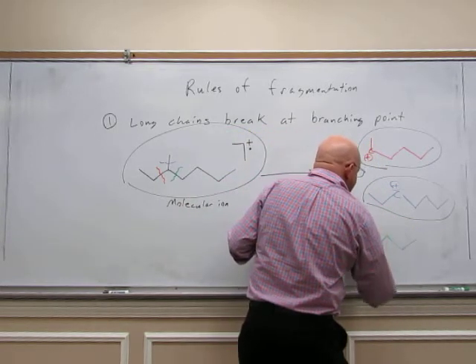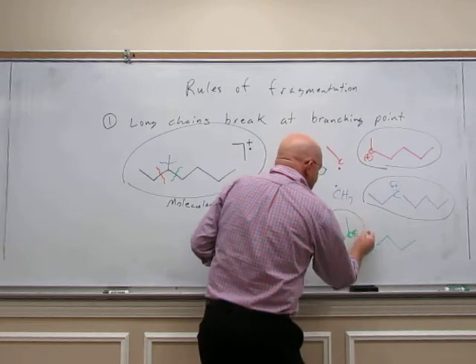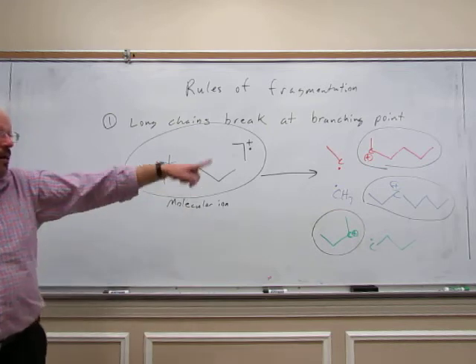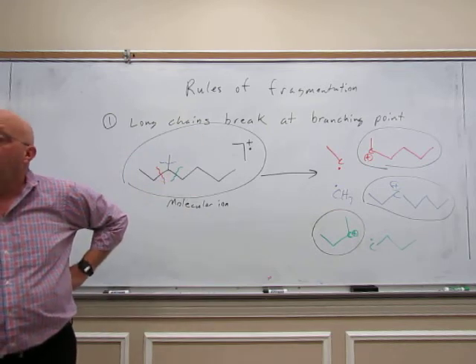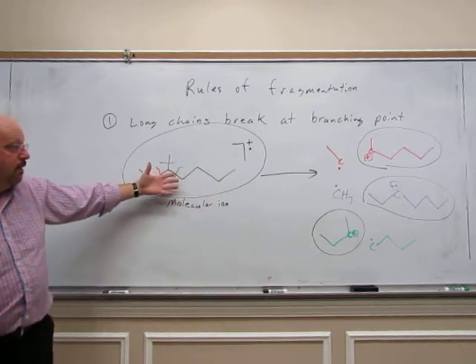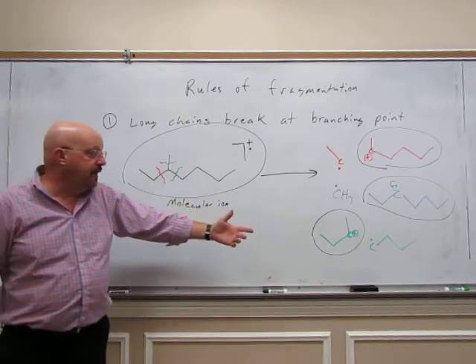Peak for that cation. Only the cations show up. So I will see a peak for all of those cations. All of those will show up, whatever those weigh. You can add them up if you need to see how much they weigh.